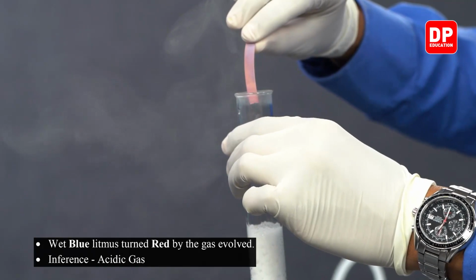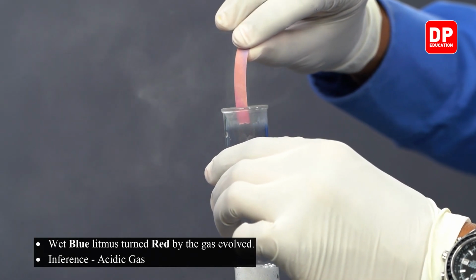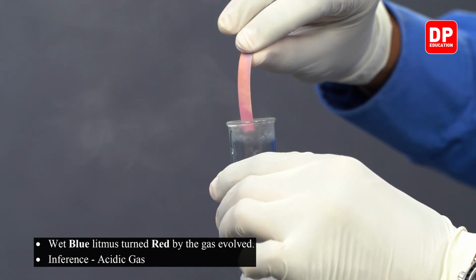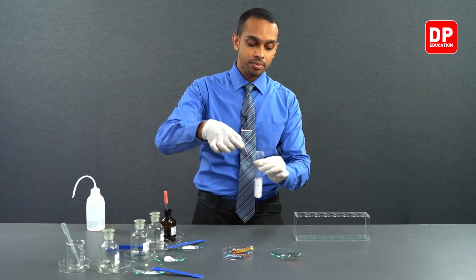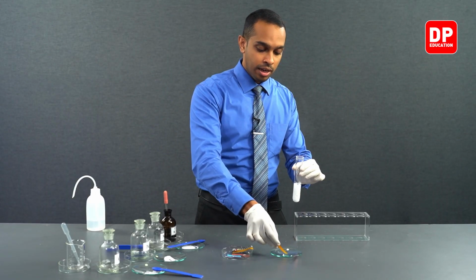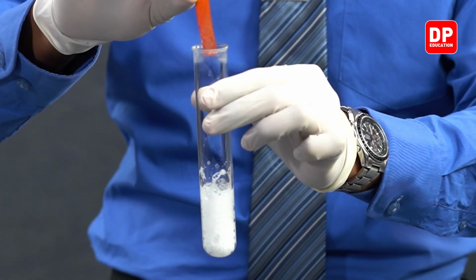As you can see, when I hold a wet litmus paper onto this gas, the wet blue litmus paper is turning red. This is an indication of the gas being acidic. Now let's try using a pH paper to determine the acidity of the gas.